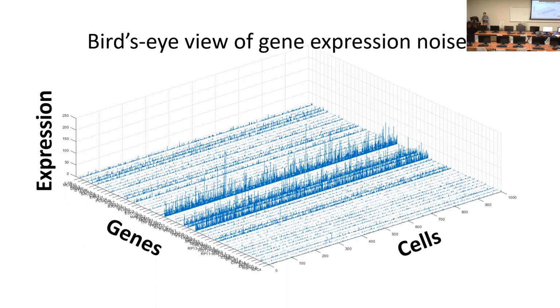Those genes are not so highly variably expressed. For example, this gene, I can't see the name, INFS. Anyway, it looks like there's some noise, but this is not extreme.